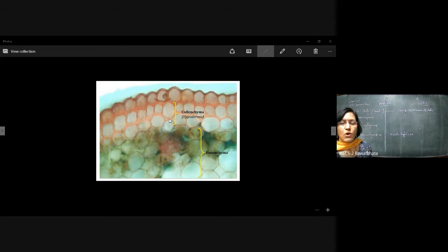And here in the collenchyma, we have covered in case of a particular diagram in the book, wherein it says epidermis, hypodermis, and endodermis. So here in the hypodermis, we have this collenchyma, wherein there is this thickening in between two adjacent cells. This thickening, once again I repeat, is outside the cells, wherein the adjacent cells interact with each other.